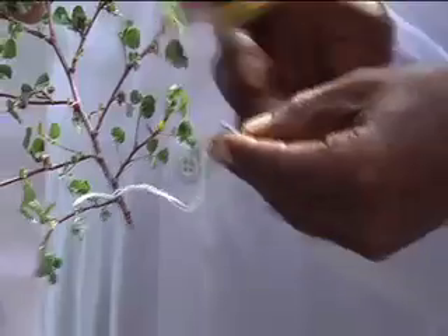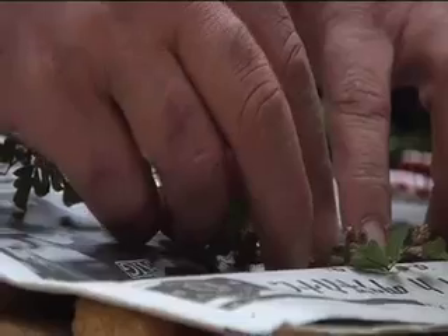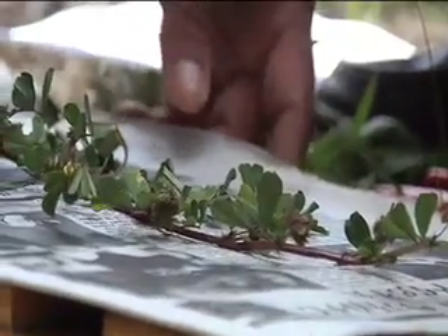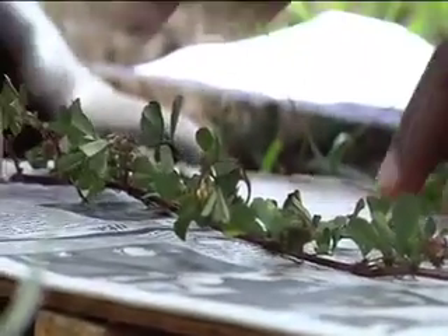Samples of plants should be placed flat into newspaper sheets, separated by blotters. Leaves and flowers should be gently opened and spread to show both sides, then covered with newspaper sheets. It is better to use a cardboard backing to maintain a stable condition.